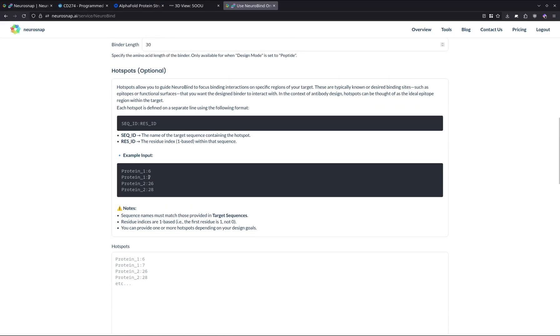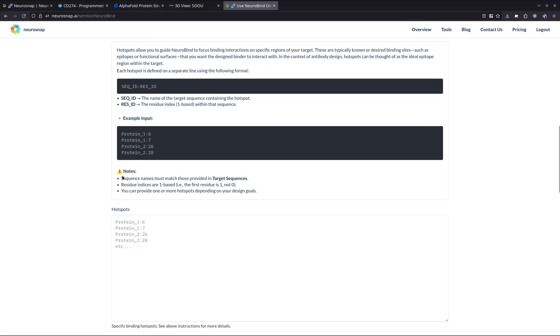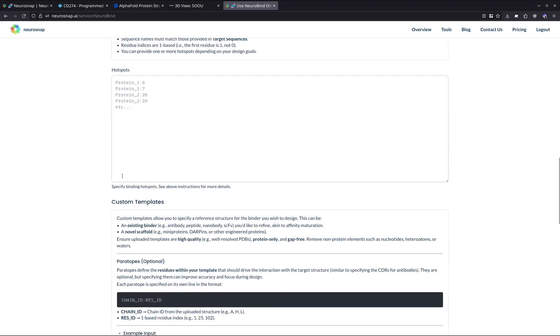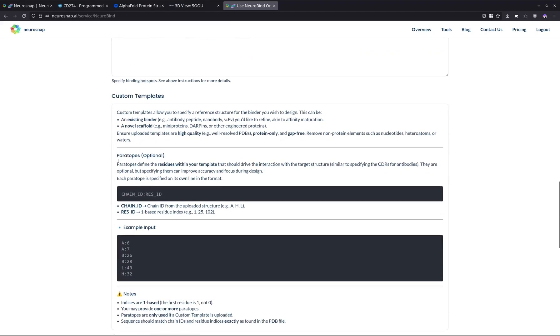Hotspots is similar to RF diffusion where essentially, if you would like, you can specify particular regions where you want the model to form an interface on the target. These can be used to guide the design process, and if you're already familiar with a particular region that you think is worth targeting, then this could be an excellent way to do so. But in our case, it's not really necessary, so we're just going to go ahead and skip that.